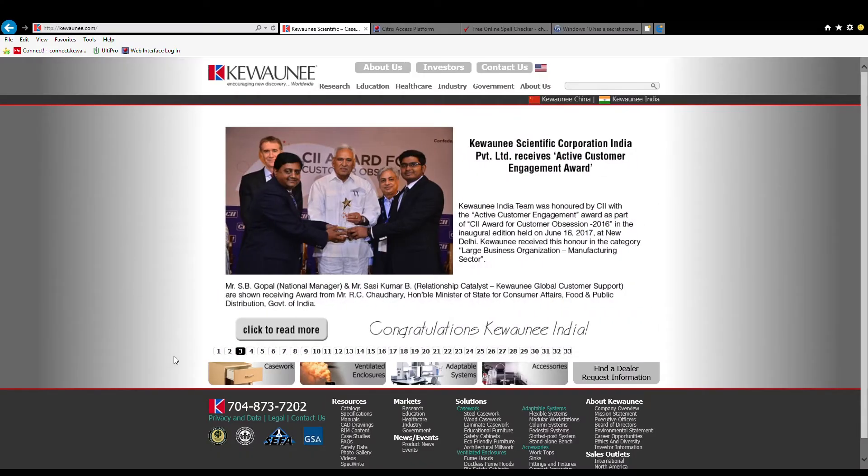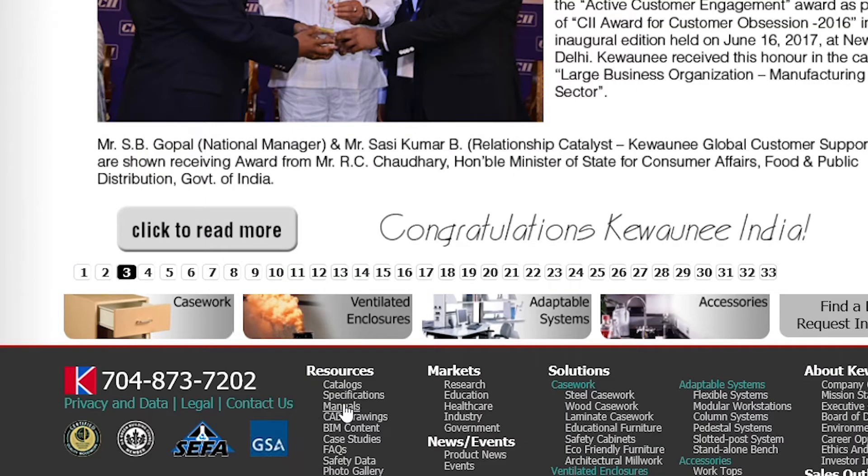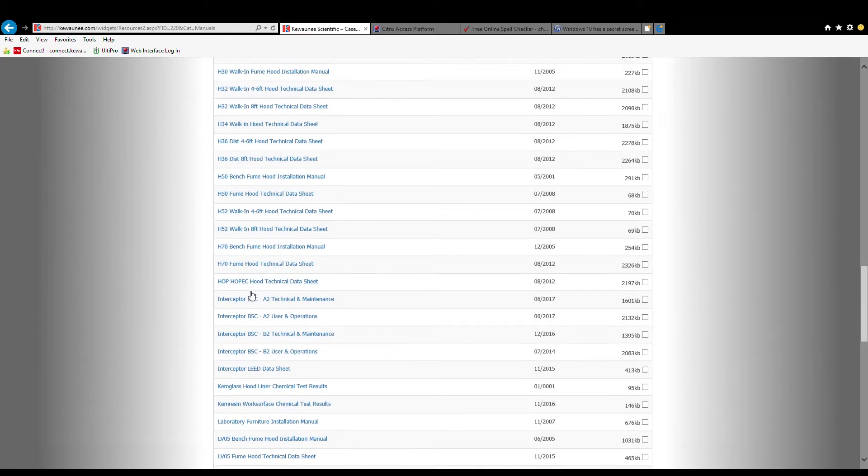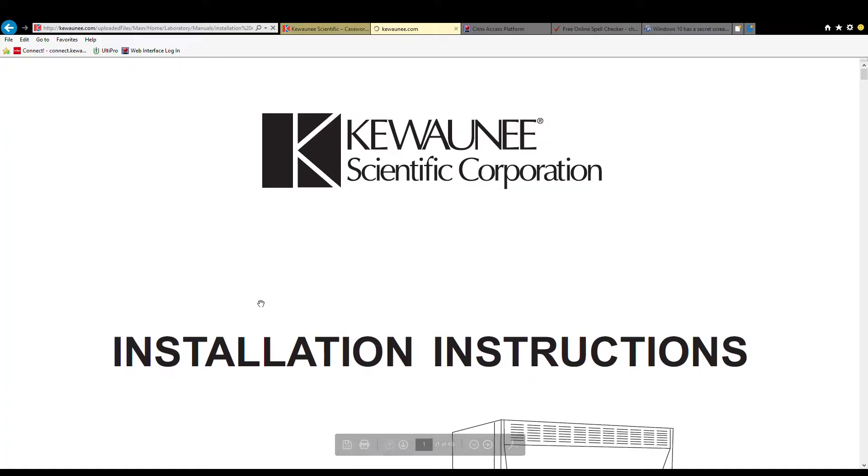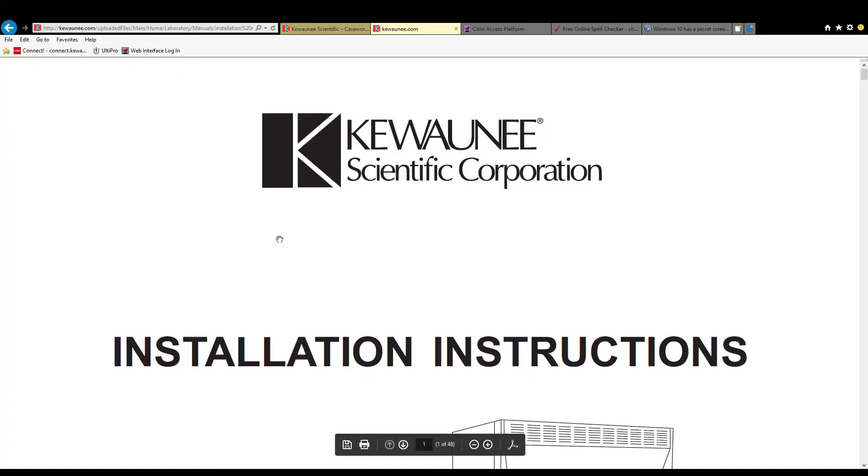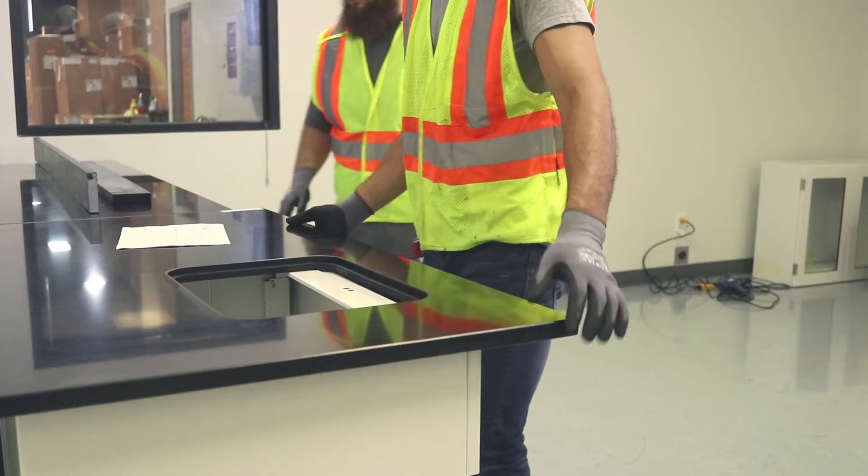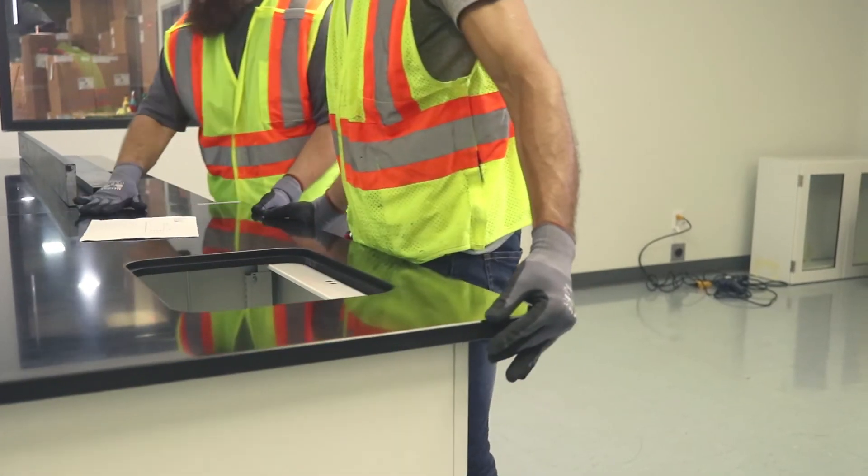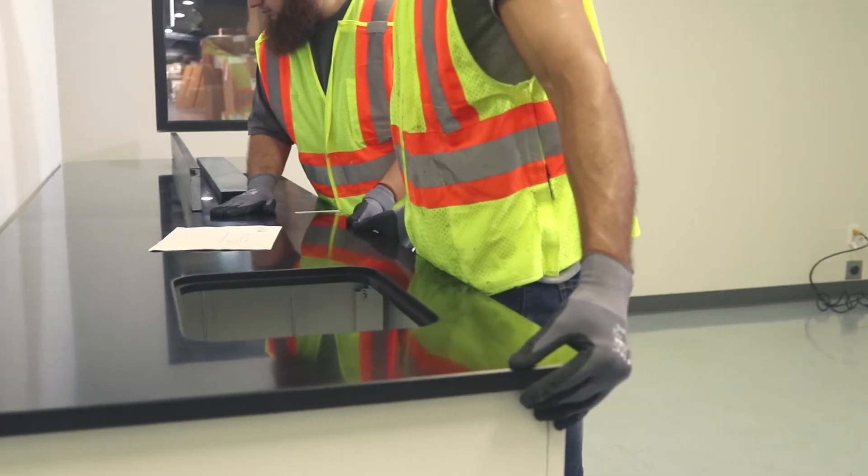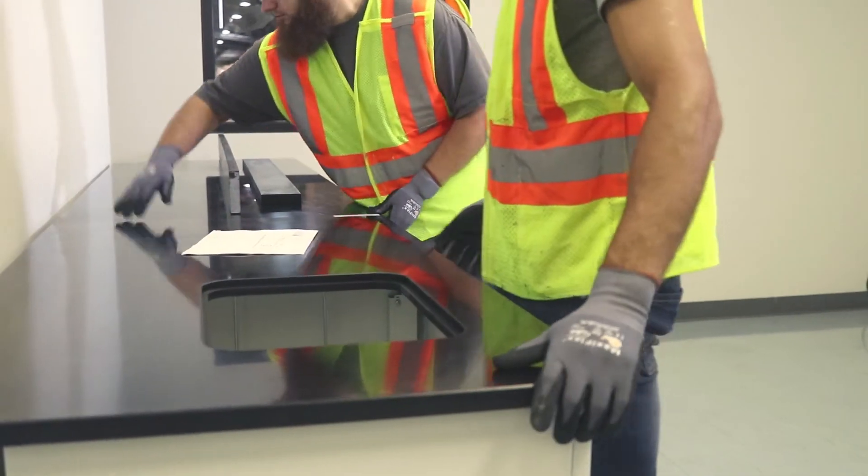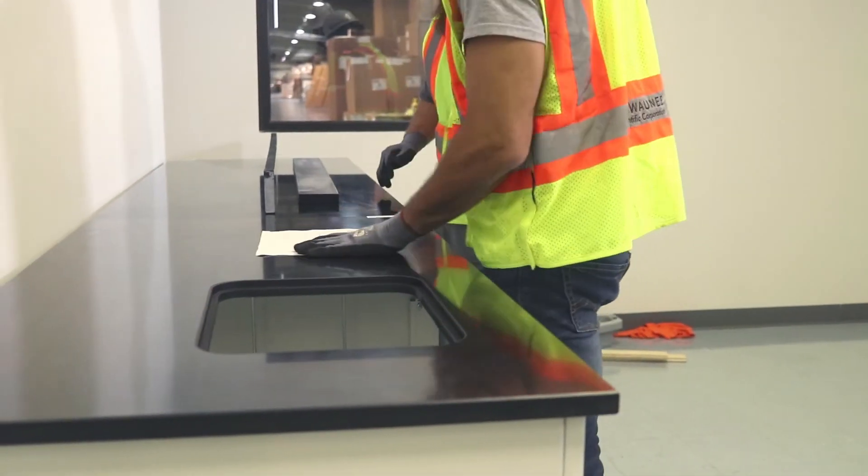The installation manual, which can be downloaded from Kewaunee.com, should be read carefully before beginning the installation. Prior to installation, all worktops should be pre-fitted to ensure they have the correct configuration and measurements.